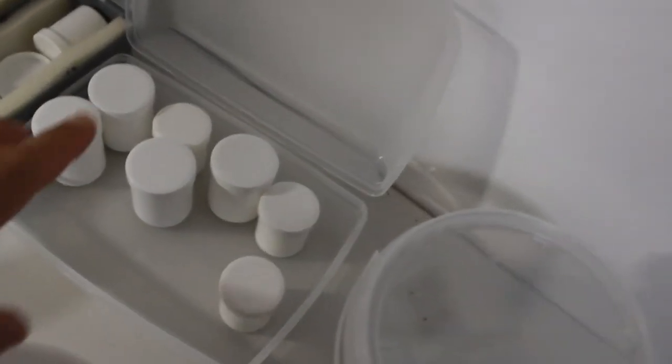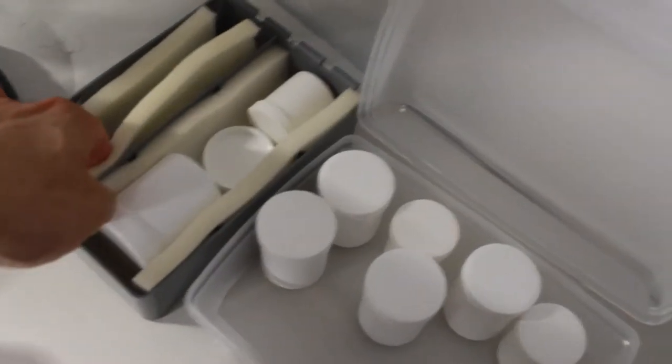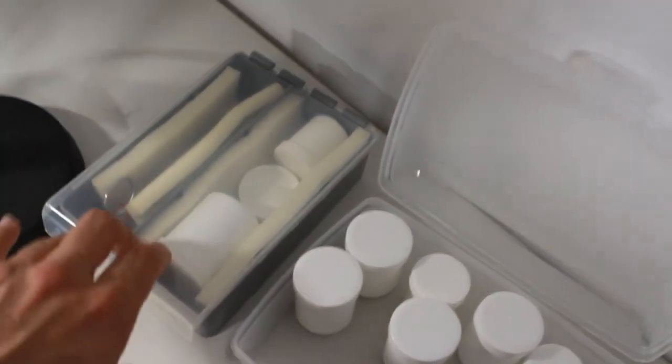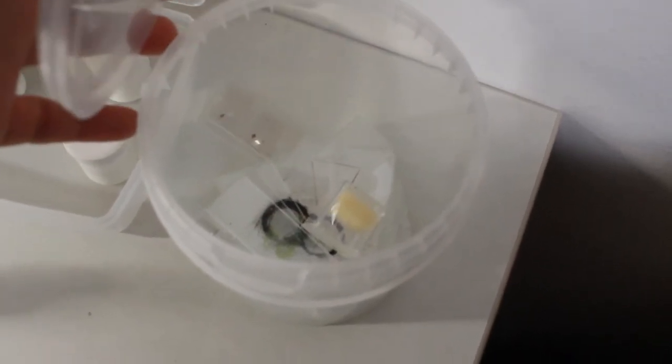In these plastic containers, I keep the specimen samples that I still have to observe. This is my little field box. I have some tools in here and some empty plastic containers, and of course, I can close everything so nothing falls out. This is my trash can. I keep used microscope slides in here. Maybe I'm going to wash some of them to recycle them, but that's also a lot of work.